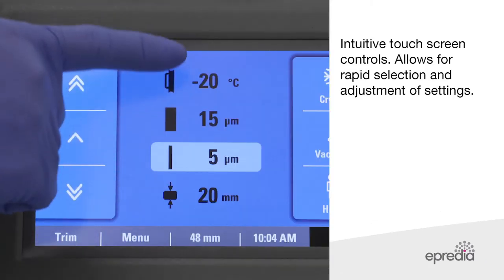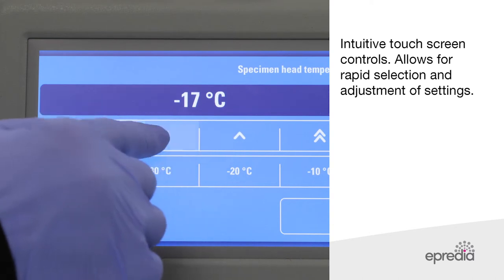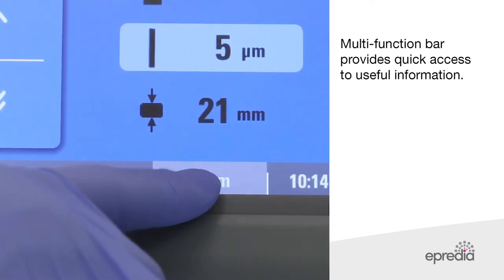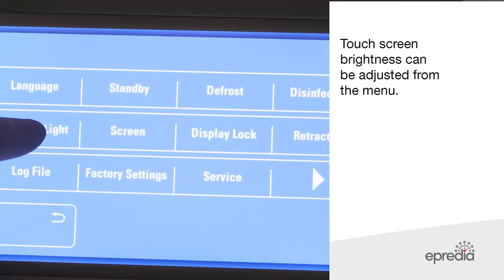The NX50 integrated colour touchscreen is icon driven and offers ease of use, accommodating multiple users. The multifunction button provides quick access to additional information on the sectioning process. Three different indications can be displayed by the touch of a button, and touchscreen brightness can be adjusted from the menu for user comfort.